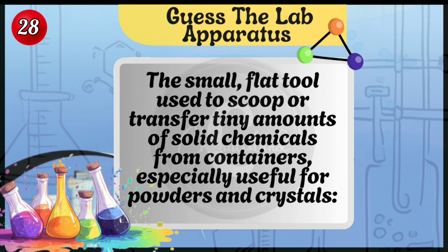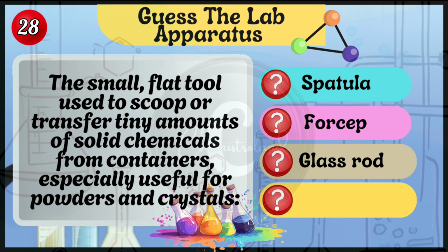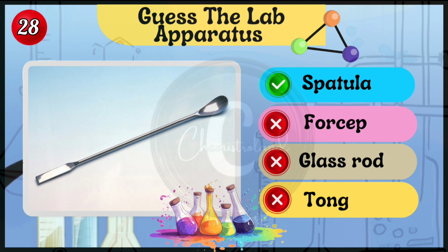The small flat tool used to scoop or transfer tiny amounts of solid chemicals from containers, especially useful for powders and crystals. Spatula, forceps, glass rod, or tongs. Spatula.